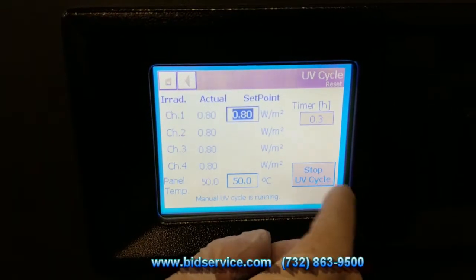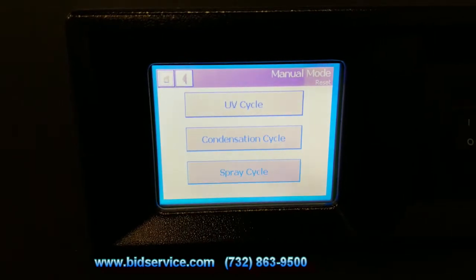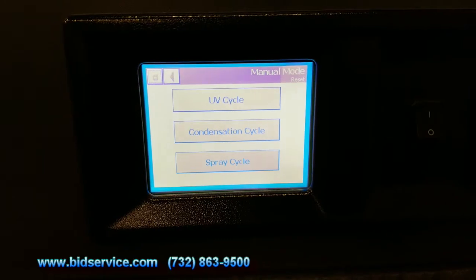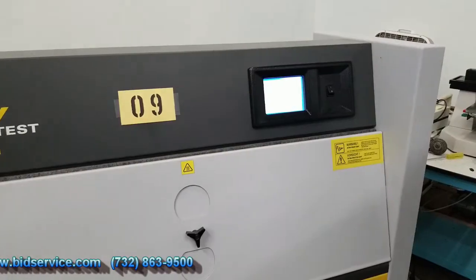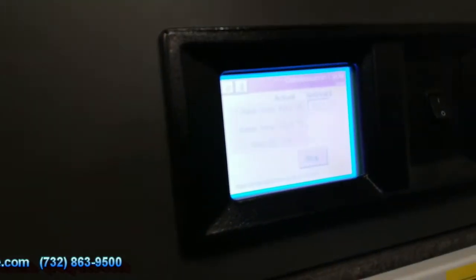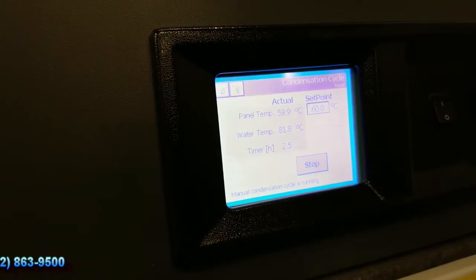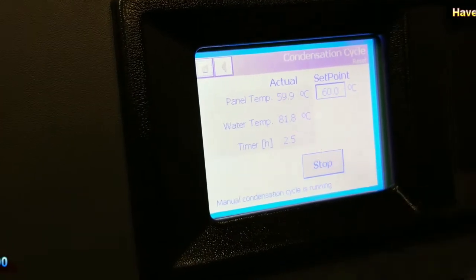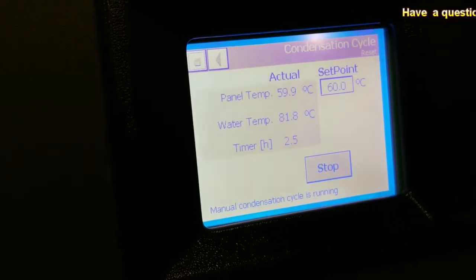I'm just going to hit stop here. We'll do the condensation cycle. I'll set that up, add some water to the system, and we'll come back and look at that. We're running it in manual condensation cycle, set for 60 degrees Celsius. Panel temperature right now is 59.9 and water temp is 81.8, taking about two and a half hours to reach the 60 degree mark.